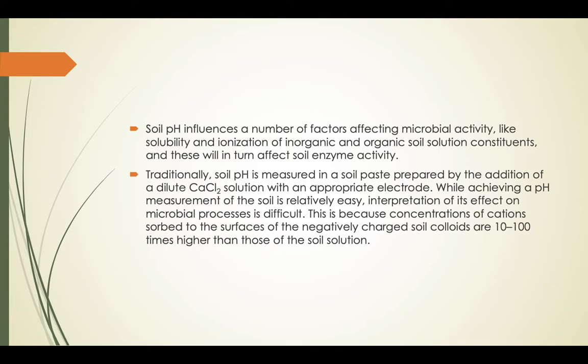The one that we expect to do, like if we did a face to face meeting, is composite sampling. Composite sampling will require accumulation or sampling of soil from the different randomized representative plots within your land.